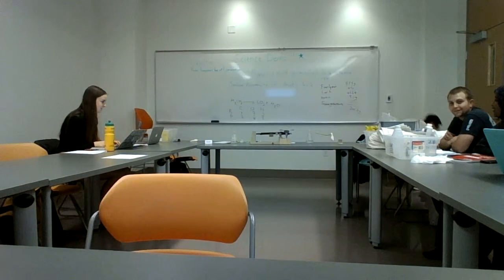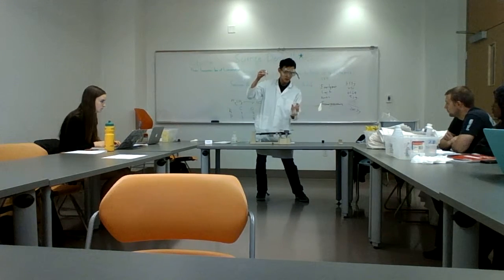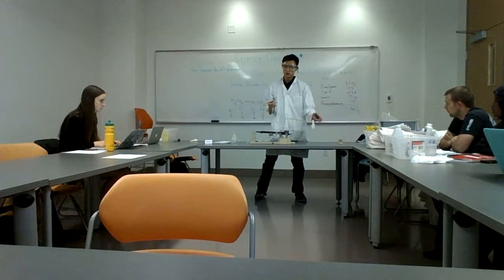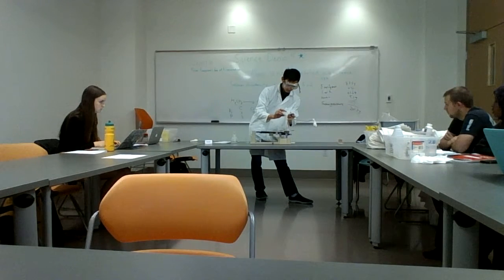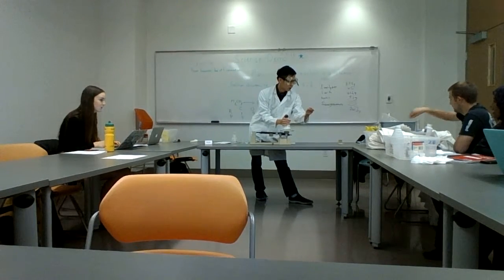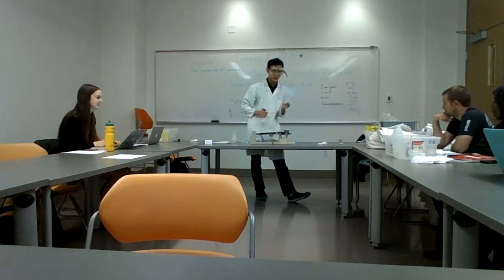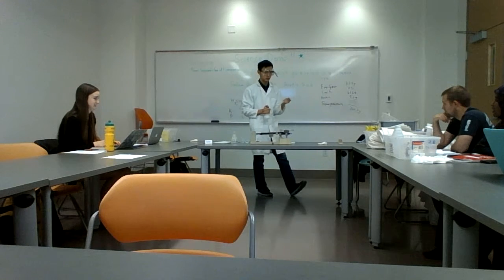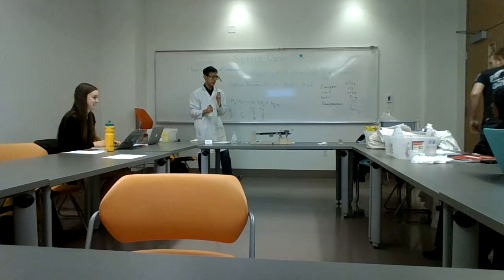This was on really tight. Okay, so I take my sodium bicarbonate and I'm going to pour it in here. You guys think a gas will form, and then what do you think happens to the balloon? Oh well, that happened. That's okay. So what's happening here? It's making gas, I'm trapping the gas, so it's building up pressure, right.